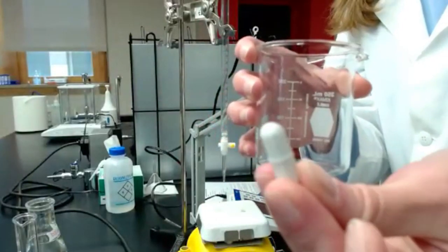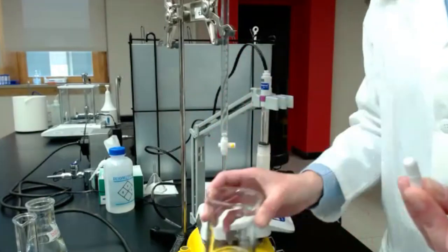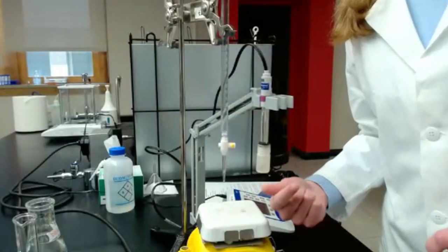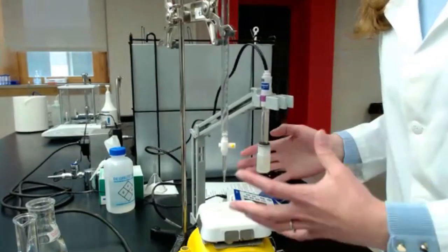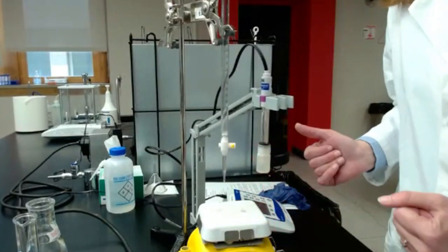If you have a stir bar and a stir plate, that's to make sure that while we do the titration, everything is being shaken. Because if we don't shake, over time, the titration won't be homogeneous, and so the measurement won't be accurate.